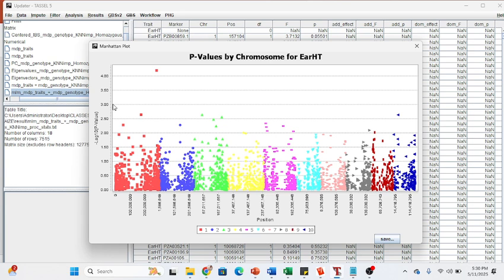So how can we interpret this in TASSEL? You might have heard about the LOD value. In TASSEL, whatever comes beyond 10 to the power minus 3 is the cutoff. Whatever comes beyond this, we consider a significant SNP for this particular trait. So for ear height, if you want to interpret, you will see the result at this SNP.